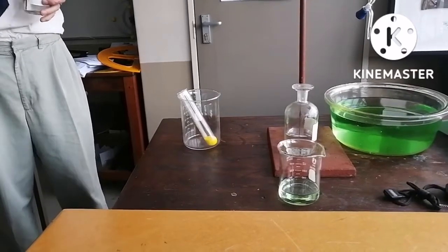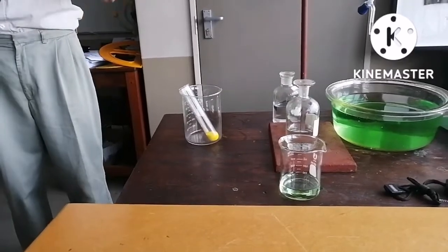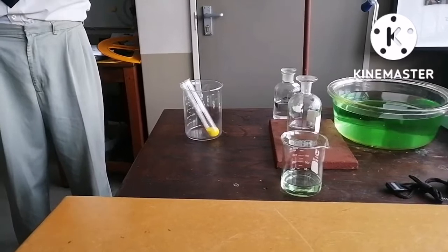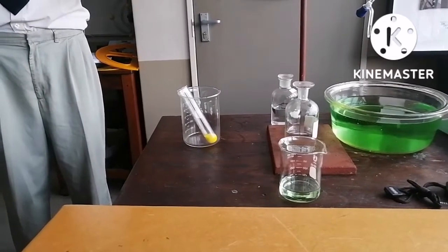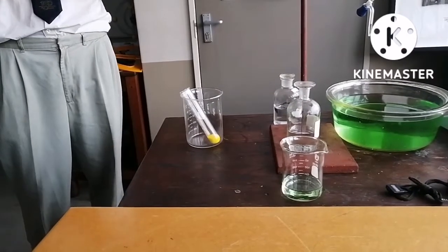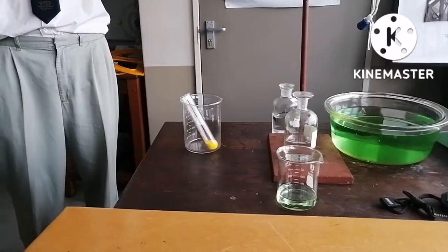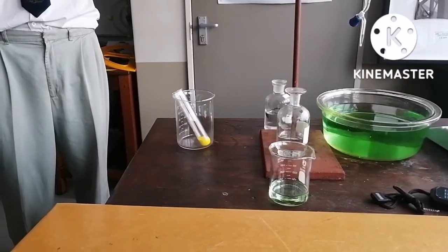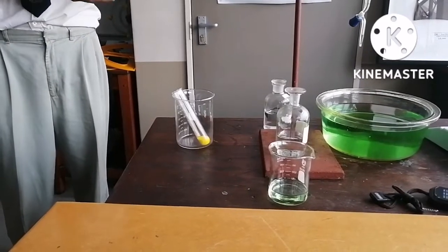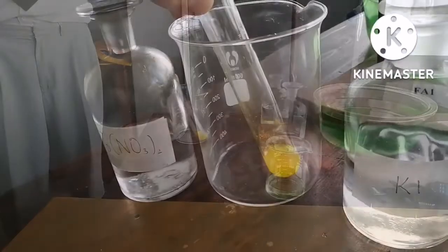Okay, and back in the Middle Ages, people would have claimed that that's magic, and I've made some weird substance that's now got a color change. But that's just a chemical reaction, and what has happened is the formation of a solid that is now in suspension. So all of the solid particles are suspended in an aqueous solution, right? That is precipitation, and that is your classic precipitation reaction, because it's got the bright yellow color and you can see the product, so it's very obvious, right?